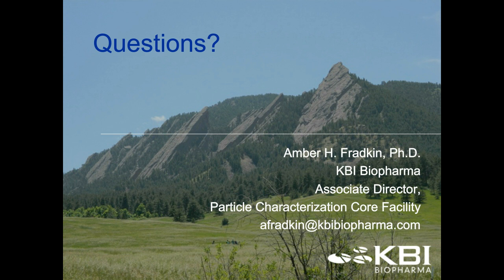We've also had a lot of clients interested in identifying those just to help them understand their particle profile a little better, again, knowing, are these silicon oil, are these protein, or are these related to an excipient? Could they be free fatty acid related? In which case, something as easy as maybe a vendor switch of your excipient source could help mitigate or reduce those particle formations later. So we've seen a lot of interest in this area for sure.